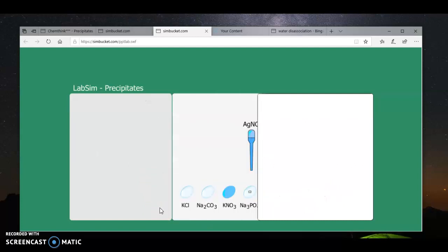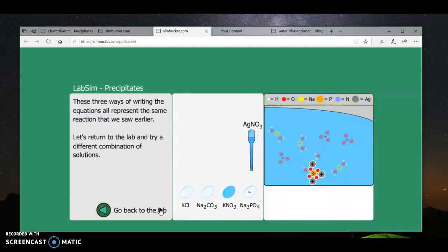So in this lab, you have seen different examples of double replacement reactions. The idea of a double replacement reaction is that both metals trade places with both nonmetals. In the single replacement reactions you saw before, only the two metals would trade places. The way you can tell if a double replacement reaction works is if a solid product forms.